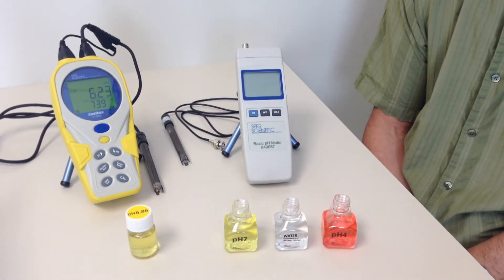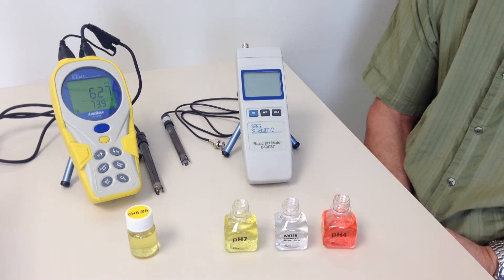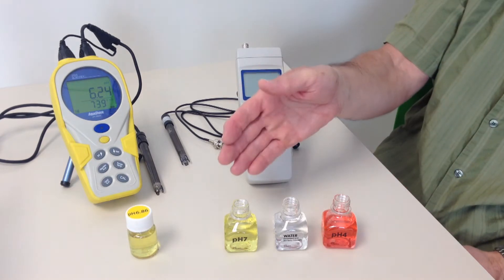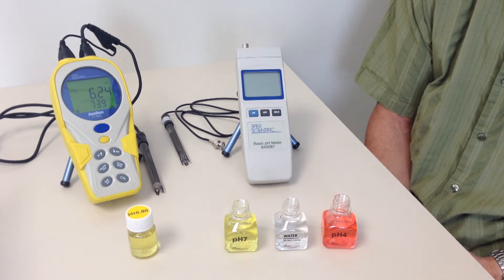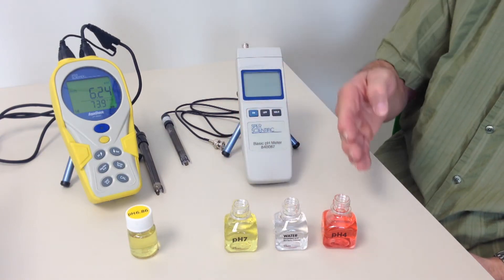All pH meters and probes drift and should therefore be calibrated prior to any series of readings. Fortunately, pH calibration is a simple process that uses standard pH buffer solutions. All you need to do is bracket the pH point you expect to measure by calibrating to buffer solutions above and below that point. For example, if you expect a reading of about pH 6, you would first calibrate the meter to pH 7 and then to pH 4.